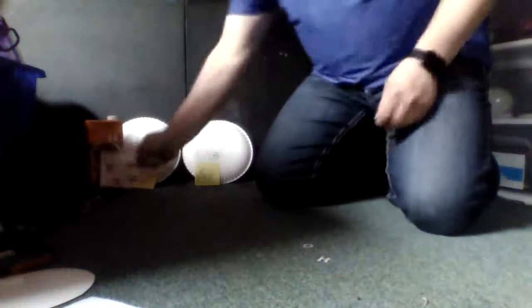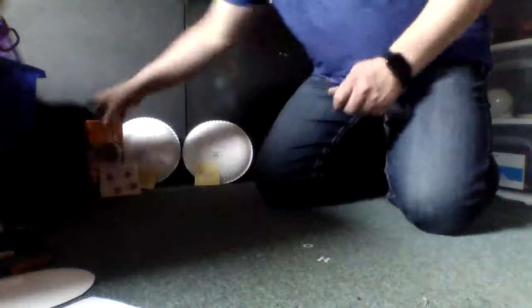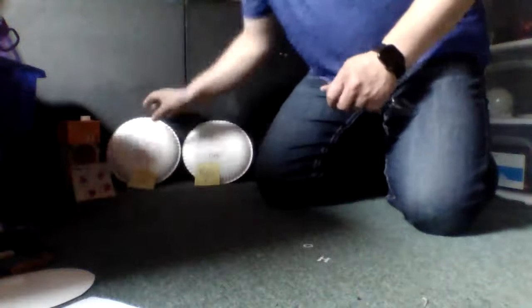Now, some of these are going to be pGLO positive, and some of these are going to be pGLO negative. Now, the pGLO negative ones are both going to be added to different media. We're using the chicken broth, and we're going to add the ampicillin. Now, when that ampicillin is added, those pGLO negative ones are going to die.